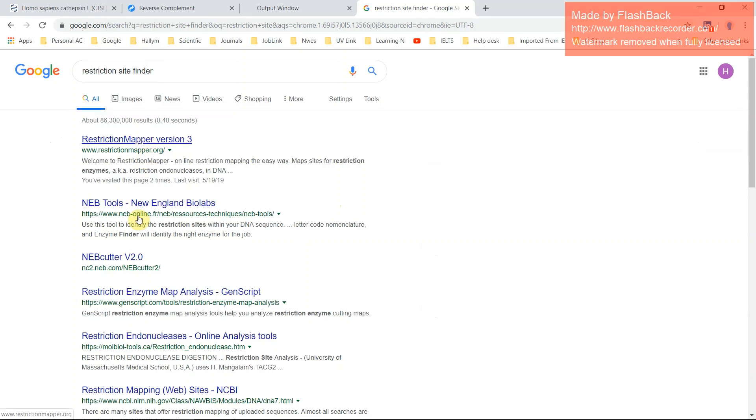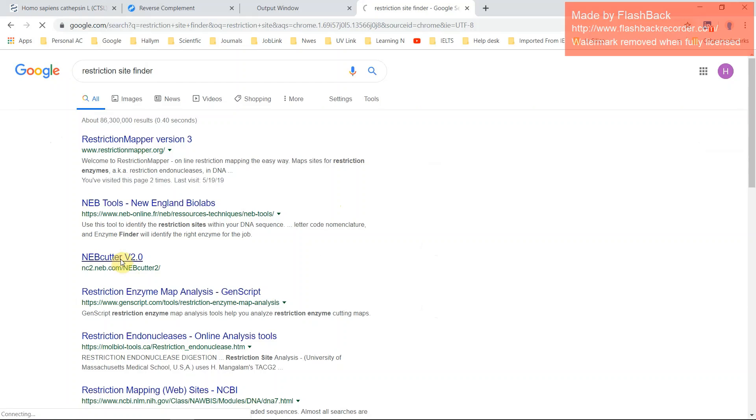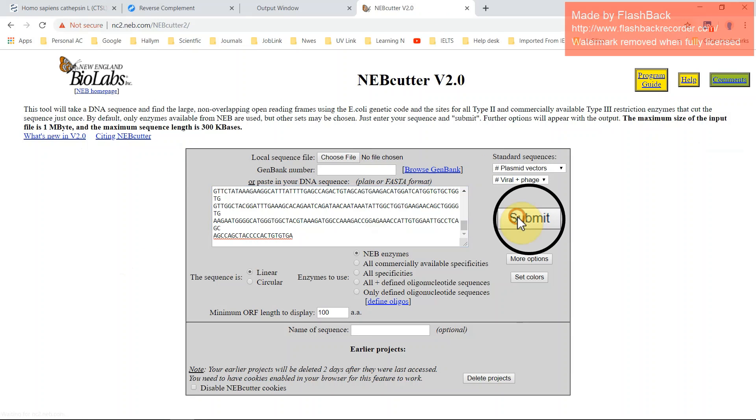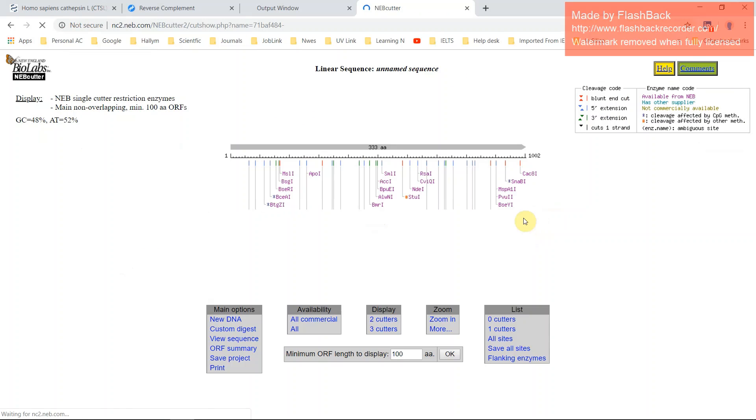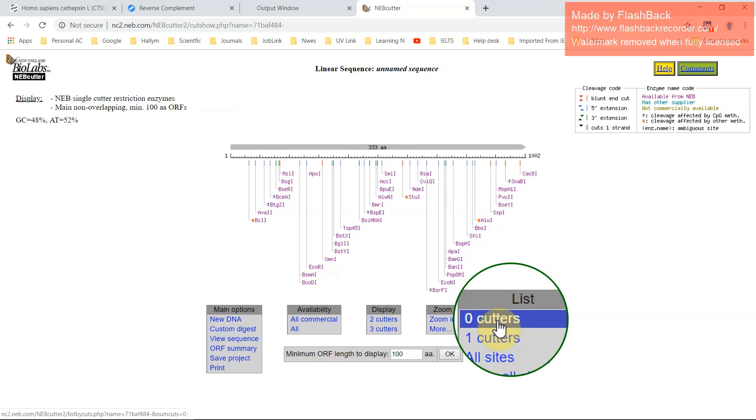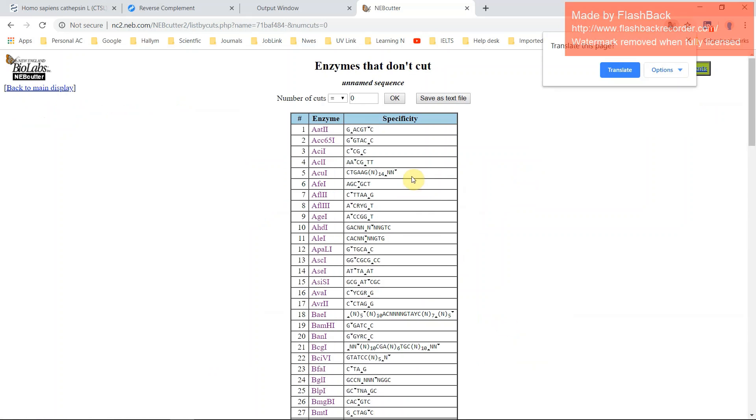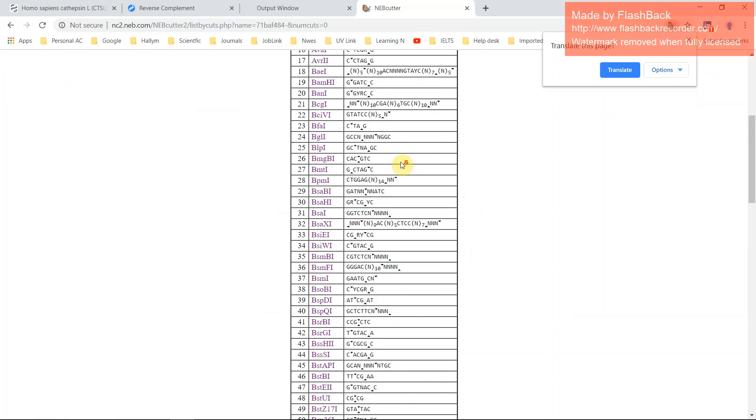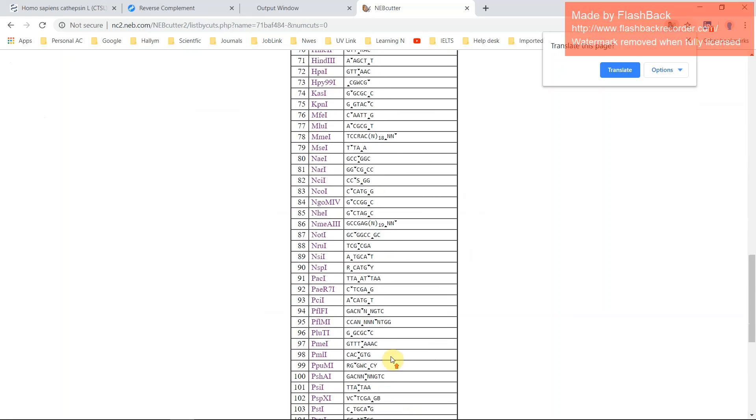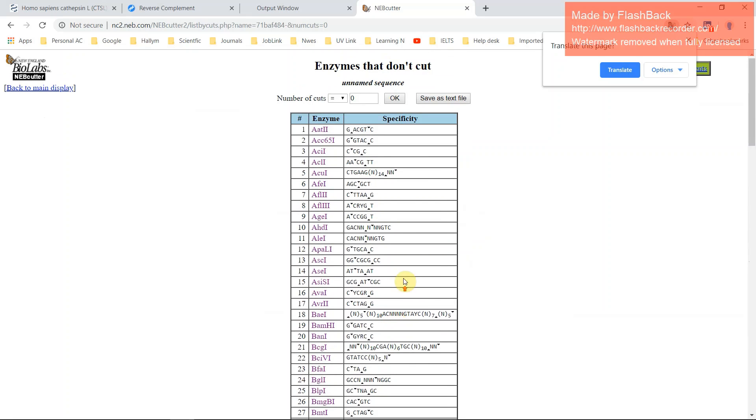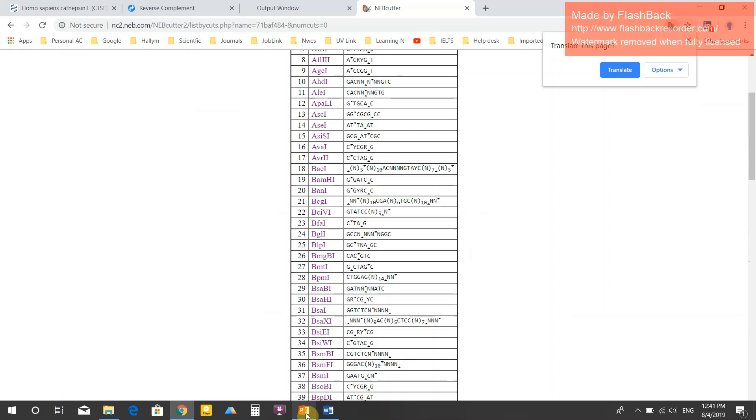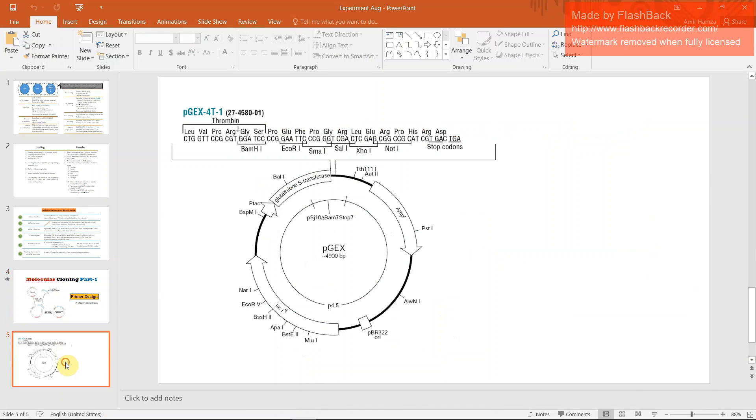Restriction mapper. NEB cutter is a more essential tool. Just click here, paste your DNA and submit. All of these will cut your DNA. You need the non-cutter. Just go zero cutters. You will find the list of enzymes that will not cut your DNA in case of your vector.